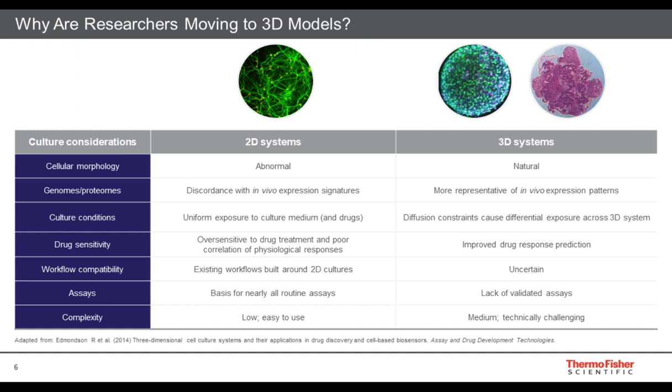That's not to say they aren't with their challenges, of course. Many of the existing workflows that researchers have been trained on and are comfortable with are all 2D workflows, and so being able to adapt to culturing cells in 3D formats is challenging, and sometimes simply switching from one to another is not overly straightforward.